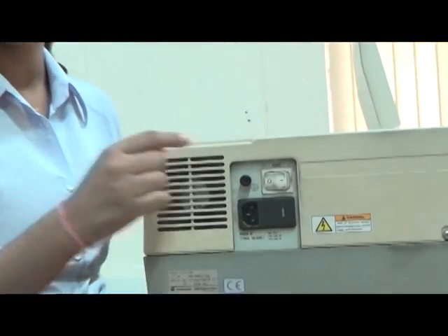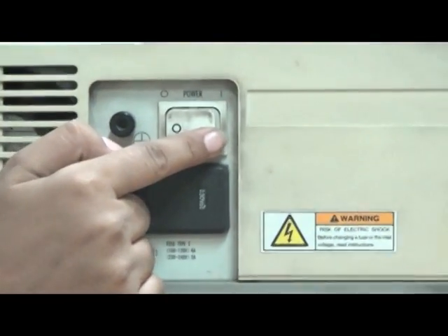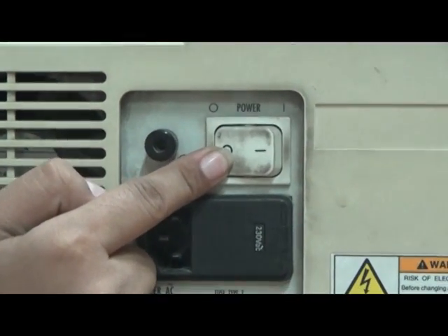This is the left side view of the spectrophotometer. This is called the power switch. When I is pressed, it is on. When O is pressed, it is off.